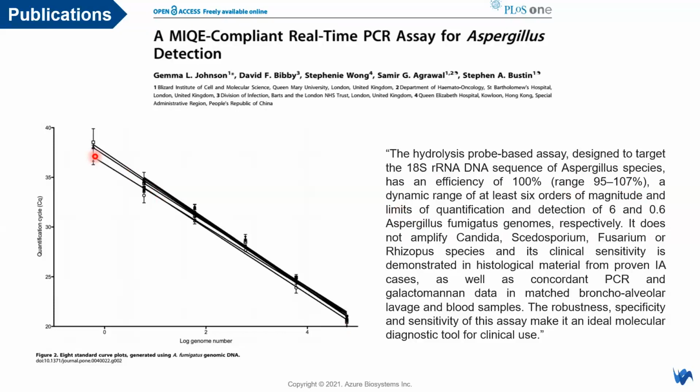They also tested the limit of detection and quantification. So this is how you develop a stable and reproducible qPCR quantification strategy for your experiments.